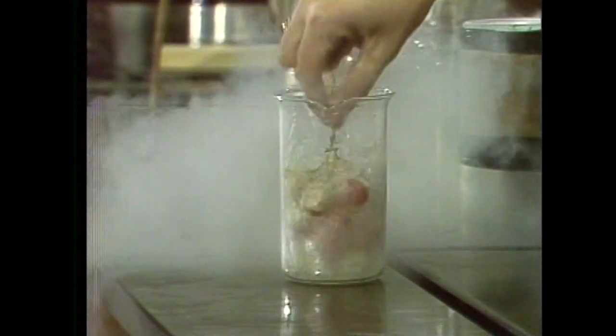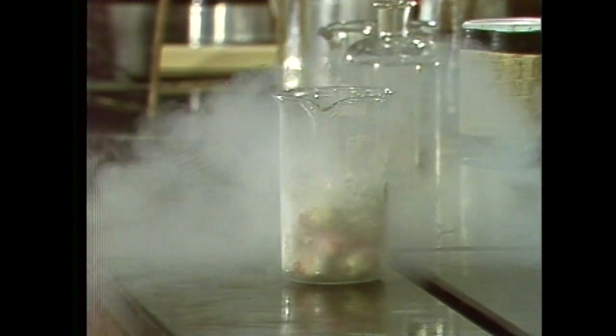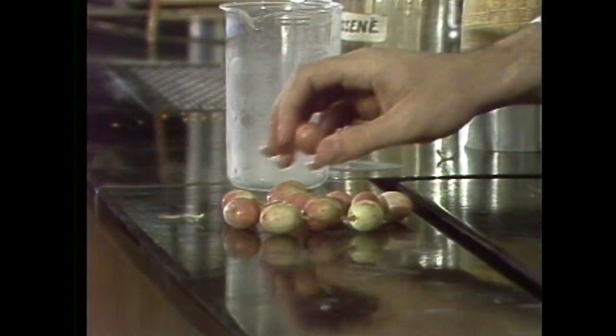And they're getting rather stiff. In fact, the whole thing is pretty cold. So let's see what happens if we pour them out. For one thing, they get to be very hard, as you can see here.